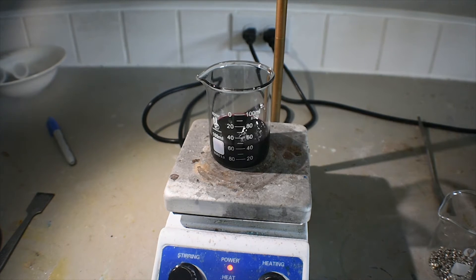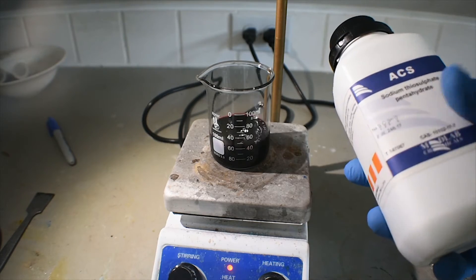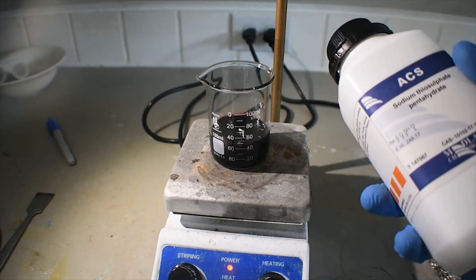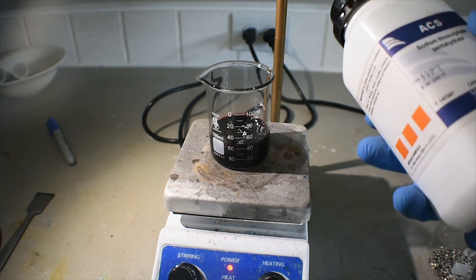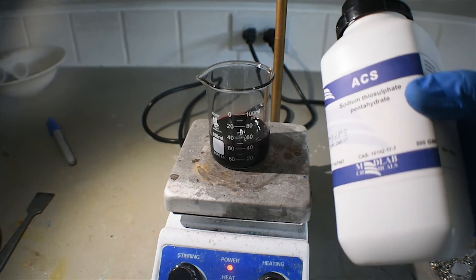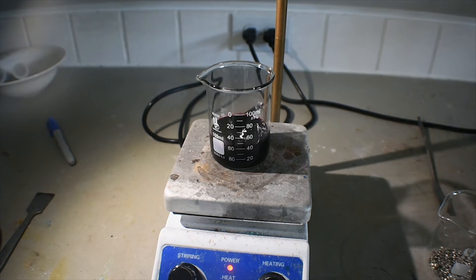This reaction can potentially get messy, of course. We are dealing with a solution of iodine in chloroform, so it is probably a good idea to have some sort of reducing agent here. I just have some sodium thiosulfate. Hydroxylamine salts work fine as well, but the undefeated champion of cleaning up iodine would probably be sodium thiosulfate. That's just a good thing to have on hand.